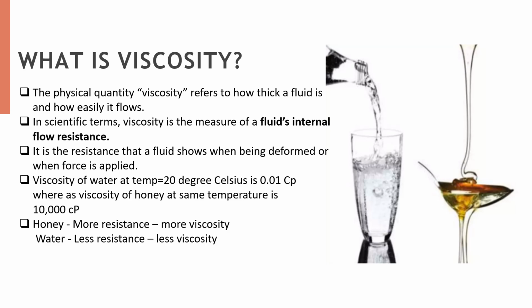What is viscosity? So, in general, viscosity refers to how thick a fluid is and how easily it flows. In scientific terms, viscosity is the measure of a fluid's internal flow resistance. This resistance is the resistance that a fluid shows when being deformed or when force is applied.